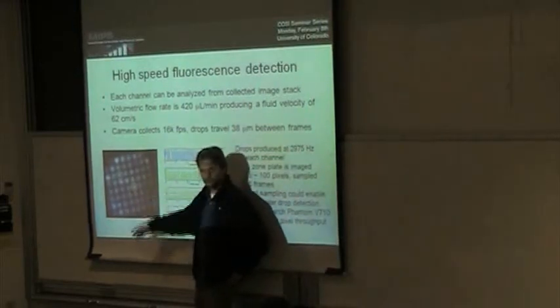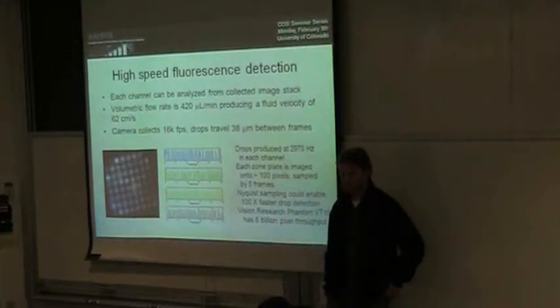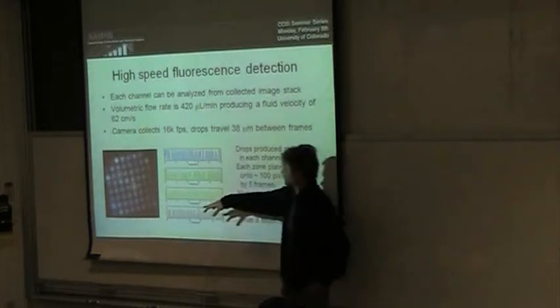Well, all I was asking is, you have all this light that you're imaging from the zone plate aperture, and what if you could just have another array of zone plates that focus that aperture back down onto a single pixel or few pixels? I can't put it on a single pixel because I need to resolve.